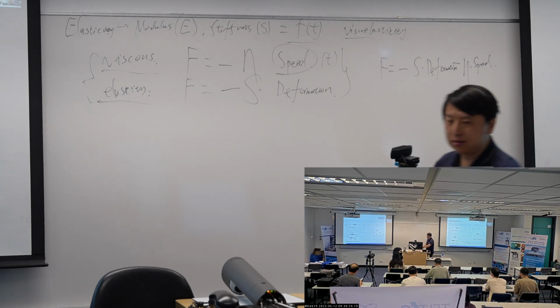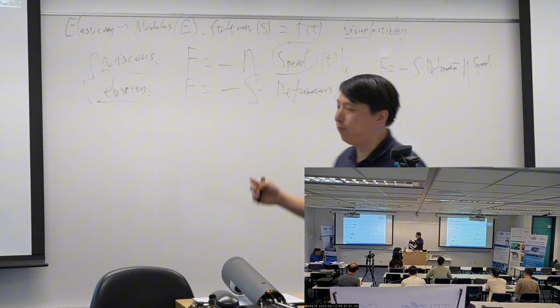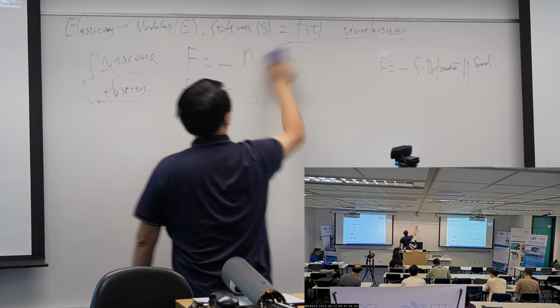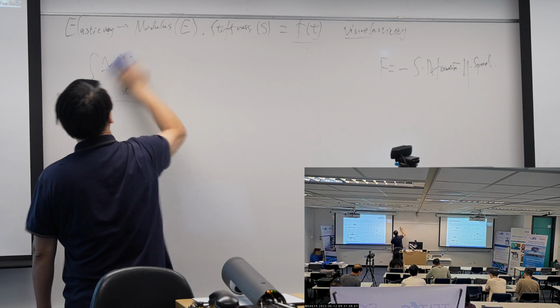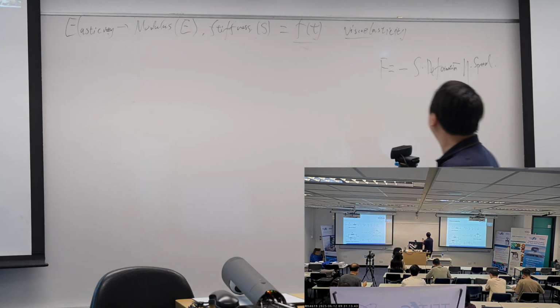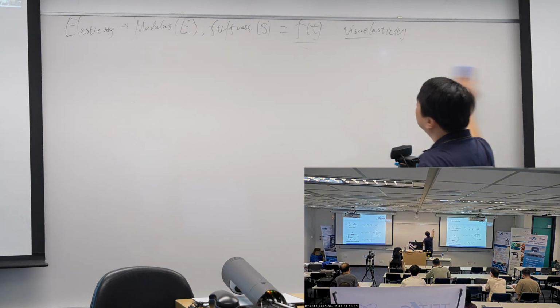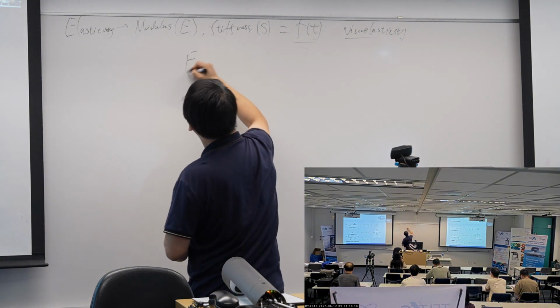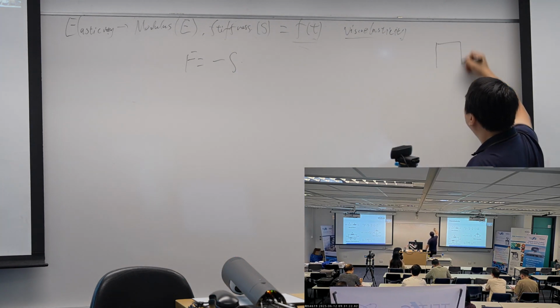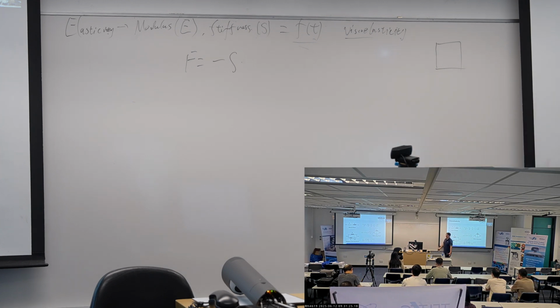Let's give a brief definition, starting from this Newton's law. Suppose we compress a certain sample, and we can sense a force.